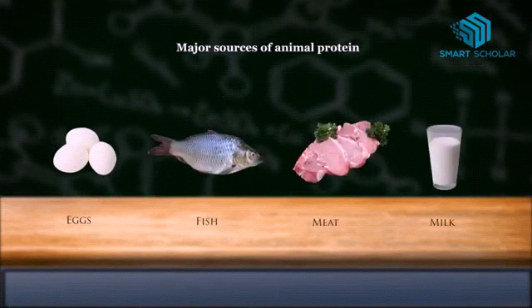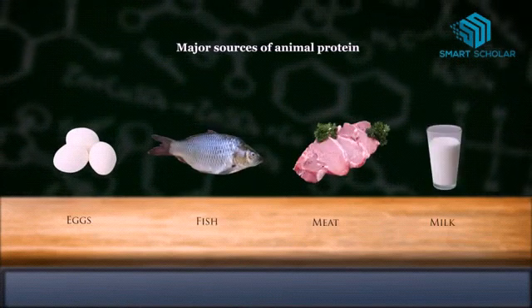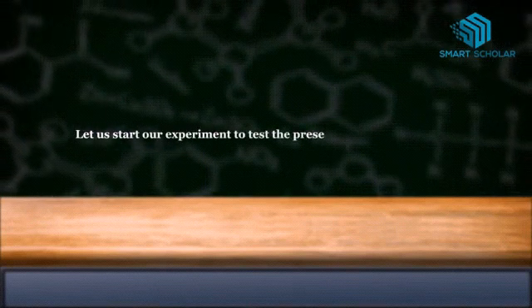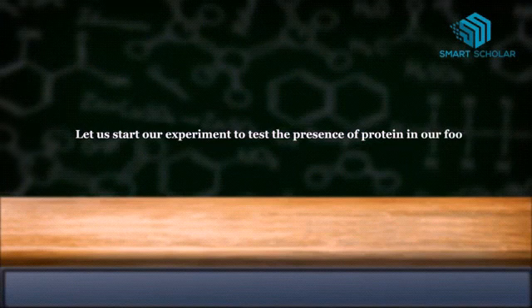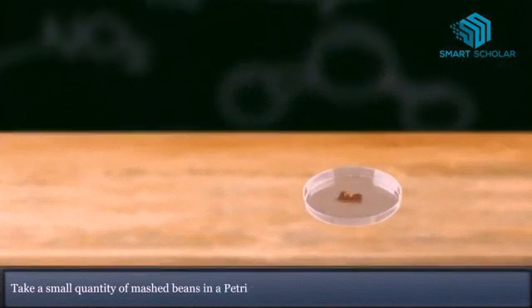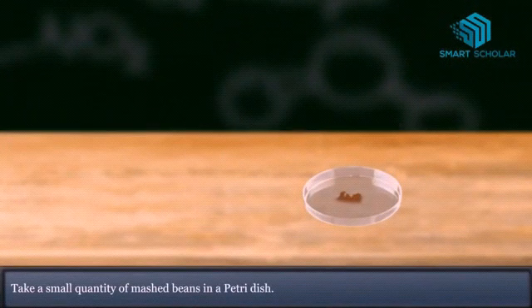Let us start our experiment to test the presence of protein in our food. Take a small quantity of mashed beans in a petri dish and put it in a test tube. Add some water.